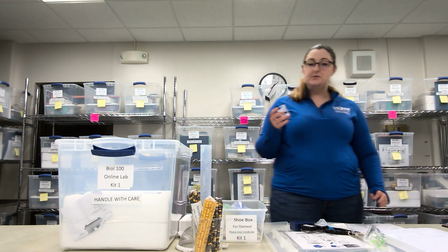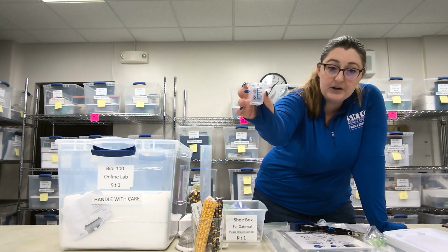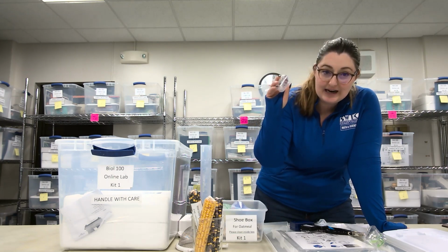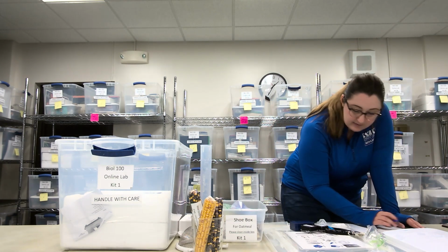Next, I want you to find the 30 to 50 milliliter beaker. This is going to be this tiny little beaker here, and it could be between 30 and 50 depending on what kit you have. So it's a really tiny guy. Go ahead, put that into the kit. And we are going to check that off.